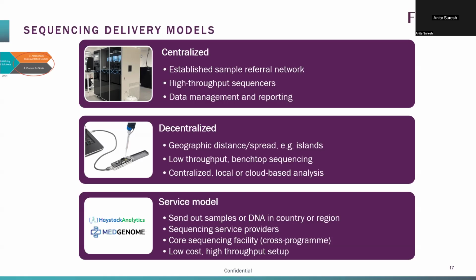Decentralized is a big one, with things like Nanopore's offering and other upcoming tools that are offering a sort of easier to use setup. You can do it in any setting. You still need some work in terms of processing the sample, but it really allows you to go closer to the patient, or closer to the facility, or closer to primary healthcare where it makes sense. Obviously, if you're looking at outbreaks, or at something quick where you want to get a result and actually do something about it, it makes sense to consider this, and countries are looking at a combination of this.